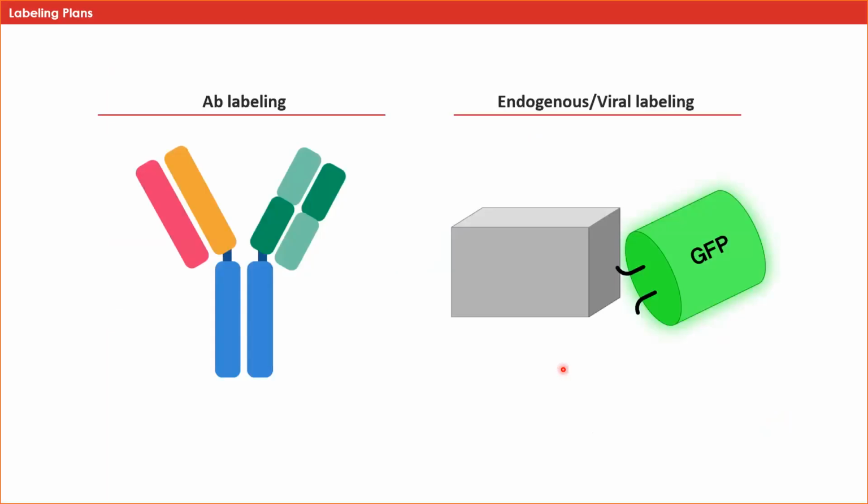If your tissues will contain an endogenous or virally labeled protein, then there is no real limitation on sample size that can be cleared, other than what your imaging system dictates. As with antibody labeling, the vast majority of clearing techniques are compatible with endogenous labels, although aqueous-based methods generally will yield better images for endogenous samples.